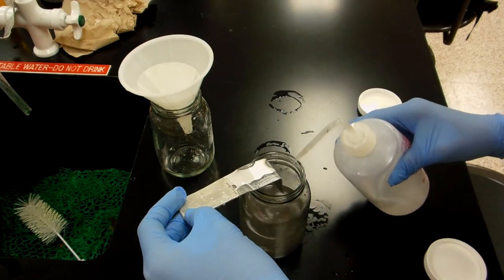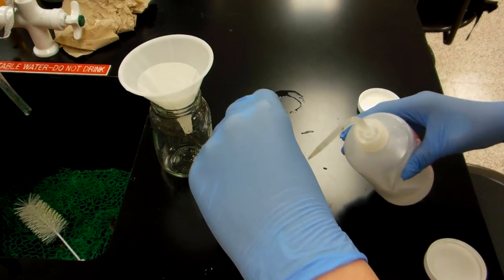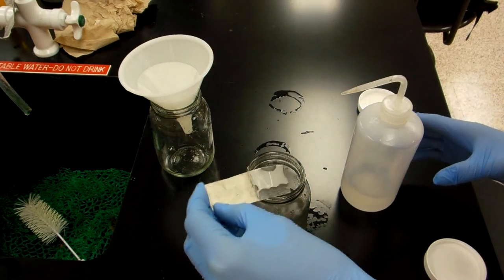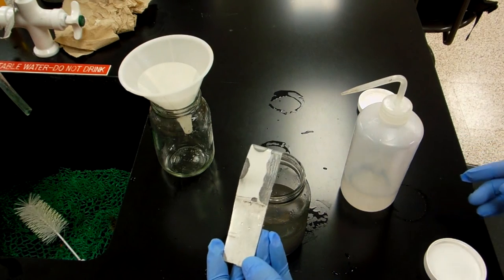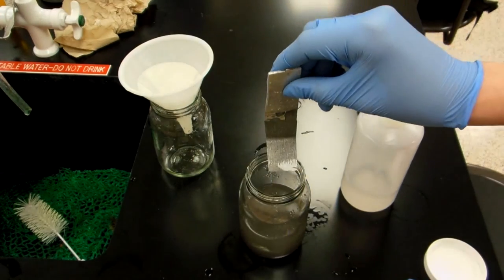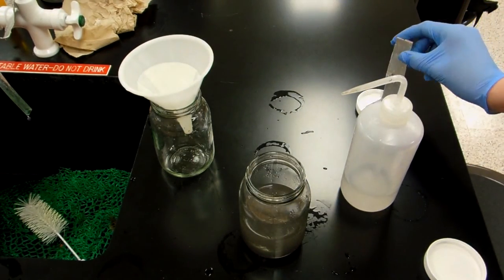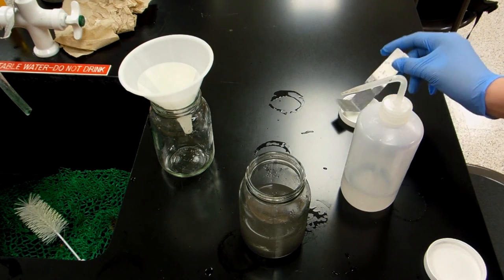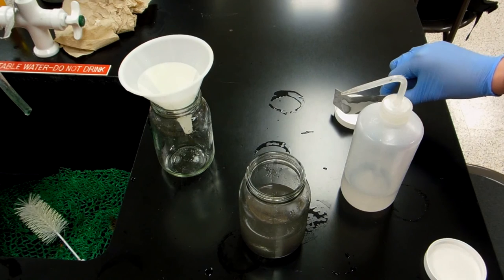By the way, there's major discoloration of the aluminum as it was eaten away by the acid. It's quite interesting. By the way, keep in mind that this reaction does evolve hydrogen gas, so don't be smoking around this or lighting any fires.